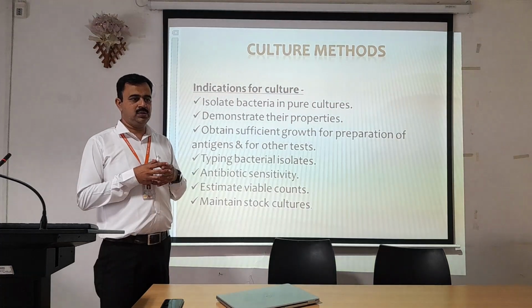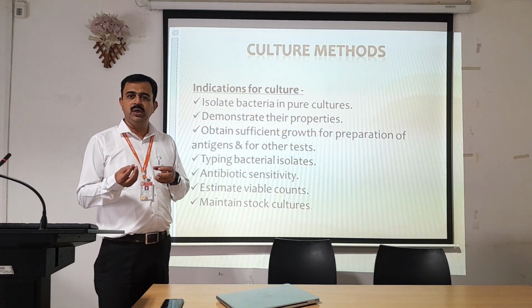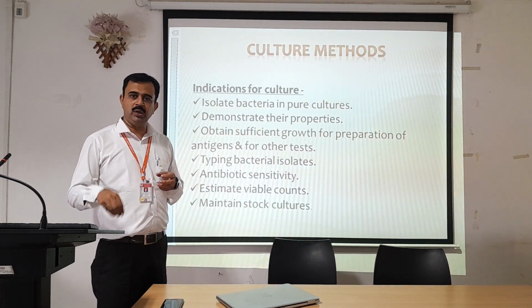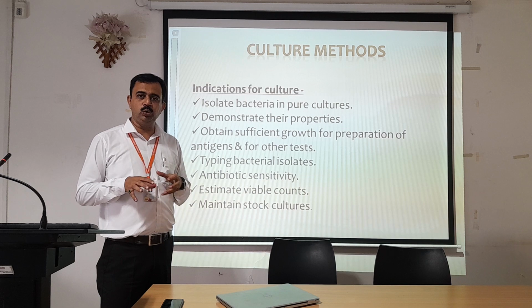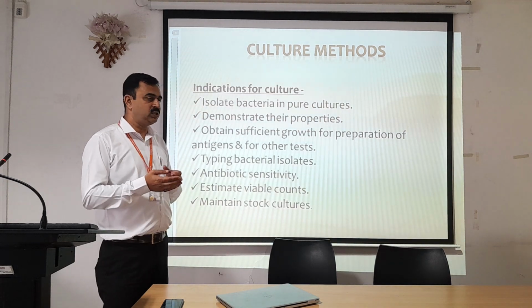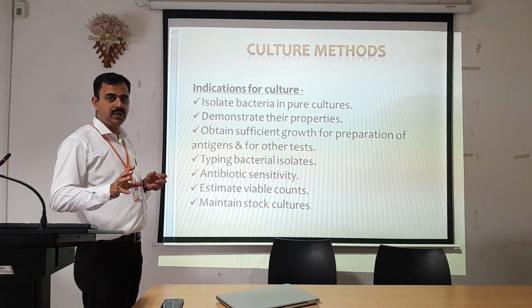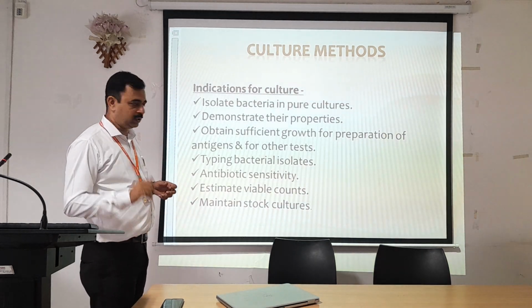Because if you have a sample in a very small amount, then there is a maximum chance you lose the sample. Therefore, if you don't want to lose the sample, then the sample can be generated from a very small amount. Many bacteria can be generated, which will be similar to their original counterpart.